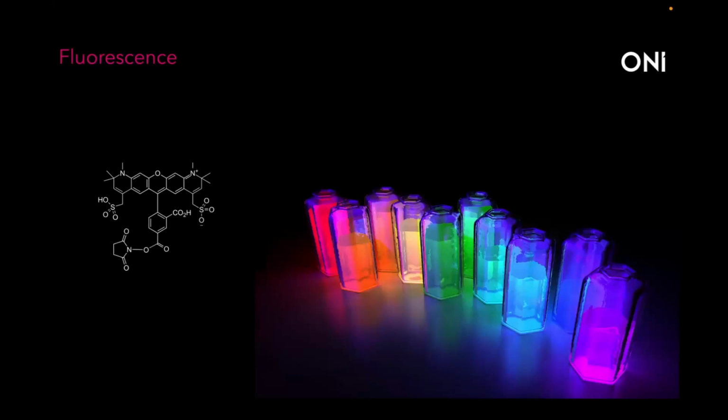For the purposes we're going to talk about today, typically this is what would be used. What distinguishes fluorophores from non-fluorescent molecules is that when fluorophores absorb light at one wavelength, they don't just re-emit it at the same wavelength. They emit a small amount of it as heat, which is this little gray arrow here, which means that when they re-emit the light, it's lost a small amount of energy.